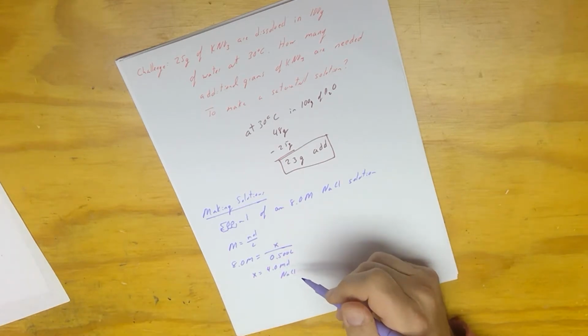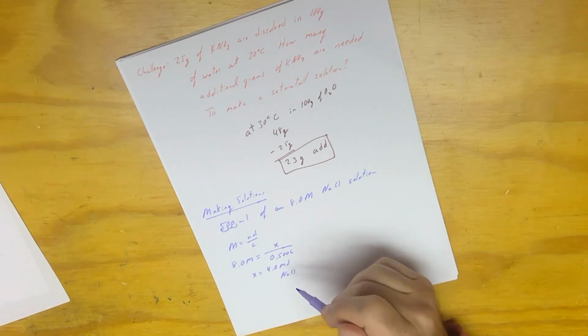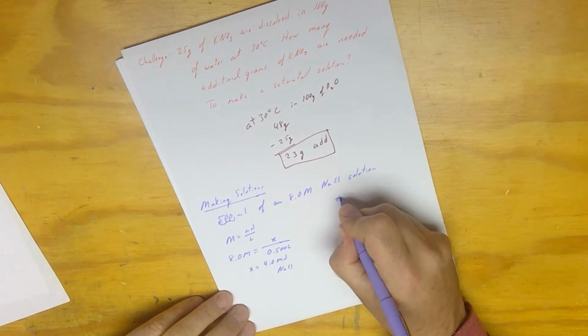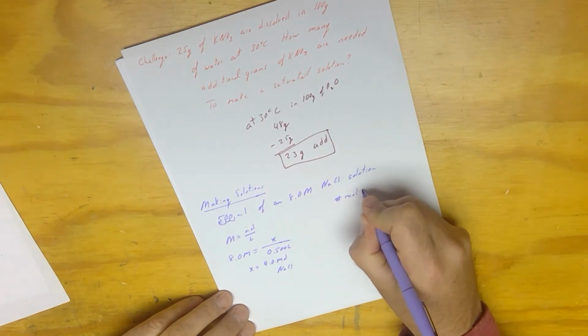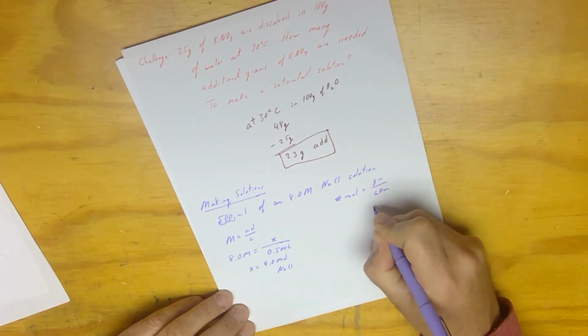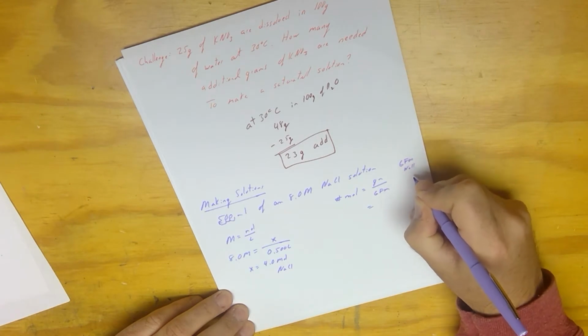Now, there's no machine that measures out moles, so I have to convert that to grams. Well, we know how to do that. Number of moles equals given mass over gram formula mass. Well, I need the GFM of NaCl.